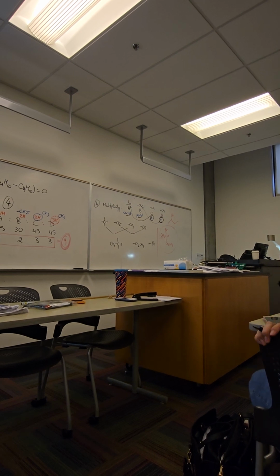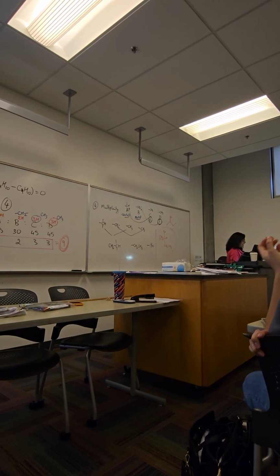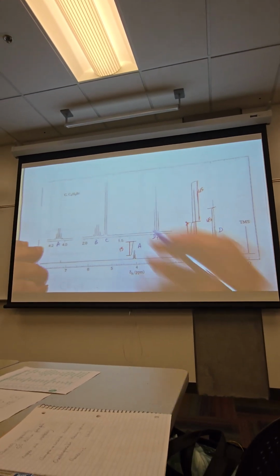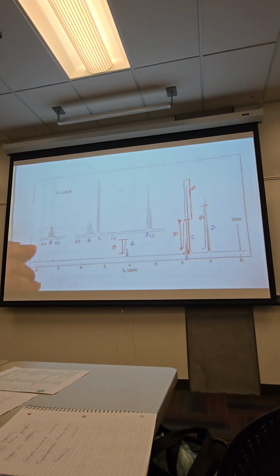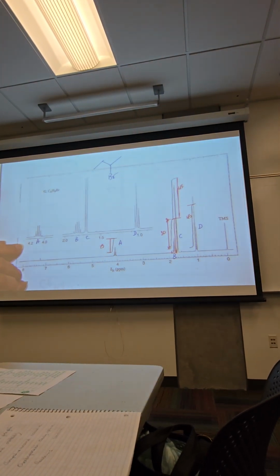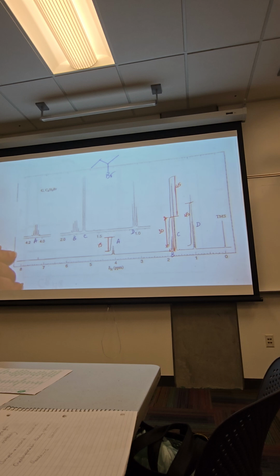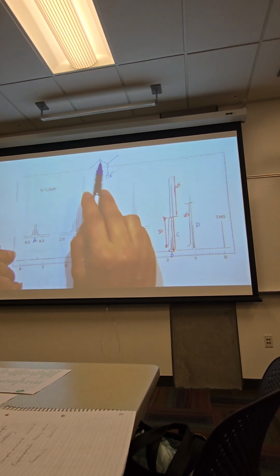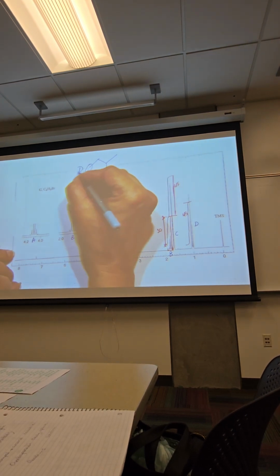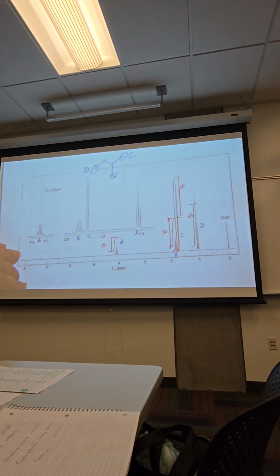So one thing that I ask everybody to do when you're dealing with spectra, both IR and NMR for that matter, is assign your signals. So you'll see this question come up too: figure out the structure and assign the signals. What that basically means is once you say, okay, that's the structure, then which of these hydrogens is D? Which position is D? It's supposed to be a triplet. So do you agree that that is D? Yep. What about C? That's C.